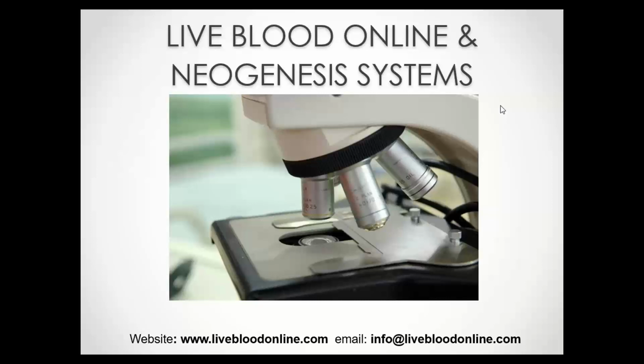Thank you. And the next question is, what type of equipment is needed and what does it normally cost? Well, the equipment used for live blood analysis is a specialized bright field and dark field microscope with a specific type of camera attached to the microscope with a cost of around $5,000 to $6,000 for the whole system.